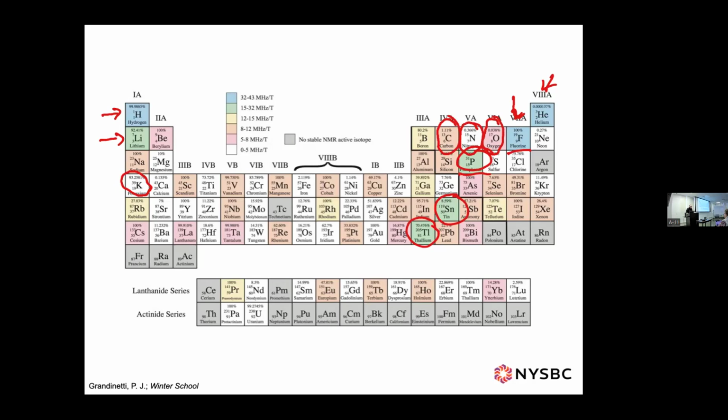Their T1s, with it being a quadrupole nucleus, are on the order of hundreds of milliseconds, so you can rep these incredibly quickly. It actually turns out that at room temperature, the hopping motion decouples proton couplings, so you don't even have to proton decouple the oxygen-17s in the water. They're self-decoupled by the motions themselves.